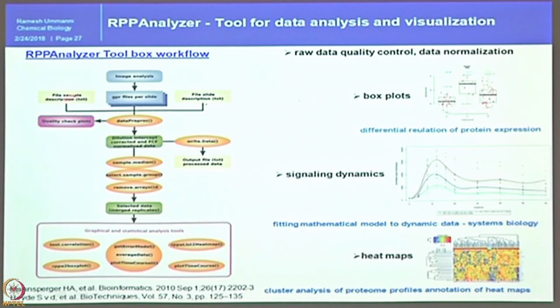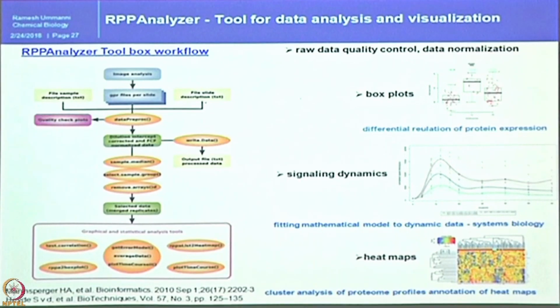Then obviously, once we have the quality control check, we always try to print a pool of samples in a serial dilution method. The serial dilution will tell whether the antibody has detected the serially diluted samples, the linearity is there, and the R value is at least above 0.9. Meaning 1 is always ideal, which we will never achieve. So, at least 0.9 is the cutoff.